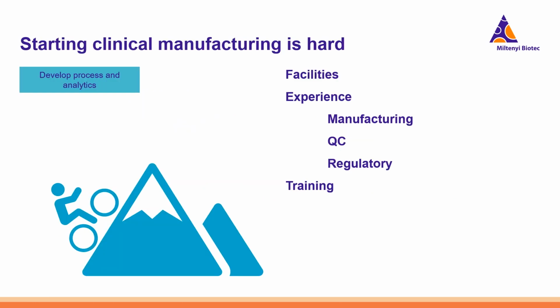To begin with, I think we can all agree that starting clinical manufacturing is not easy. And in particular, it's not easy to develop a manufacturing process and analytical methods. And it's in particular very difficult for clinicians who may be lacking the facilities, the experience in manufacturing, experience in QC, the regulatory know-how, as well as experience in how to properly train the manufacturing staff. And all of this together can make it a very daunting task to start offering CAR T cell therapies out of scratch.